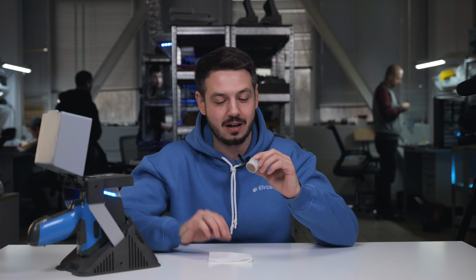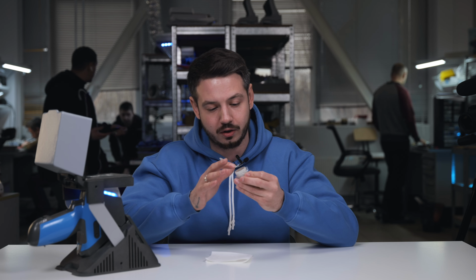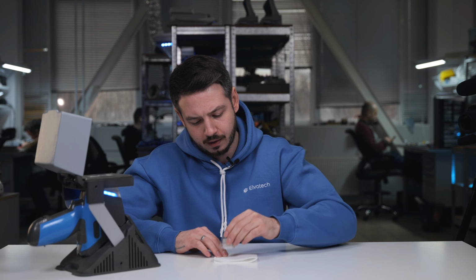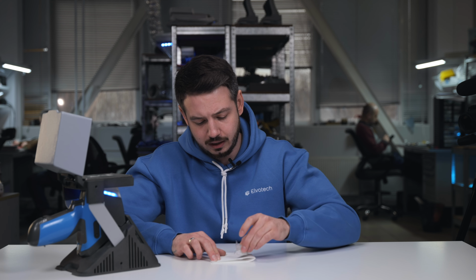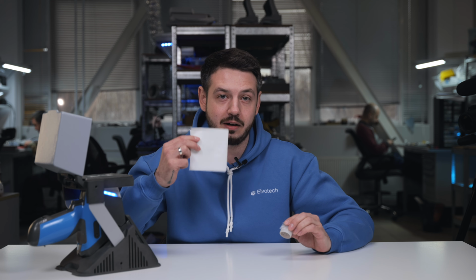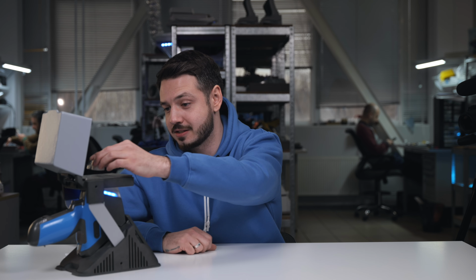All we need is our cuvette and our napkin. That's it. So firstly, we need to check all the areas to see if it's covered tightly and accurately. Here we can see that no contamination can be poured from the sample. Let's just shake it a bit and tap it onto our napkin. Just maybe slide it to understand if any contamination has poured from the sample. So now everything is covered up tightly. We have the absolutely clean napkin, so we can take it apart and start our analysis.